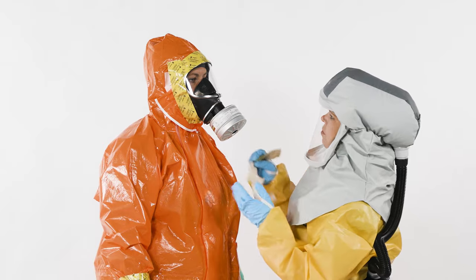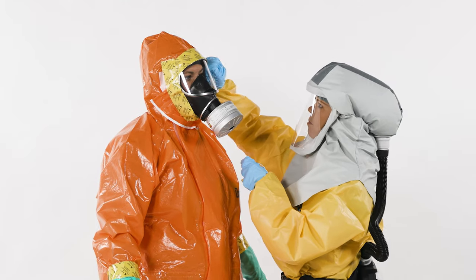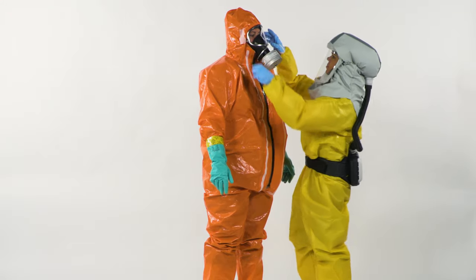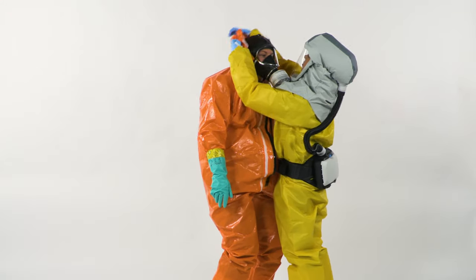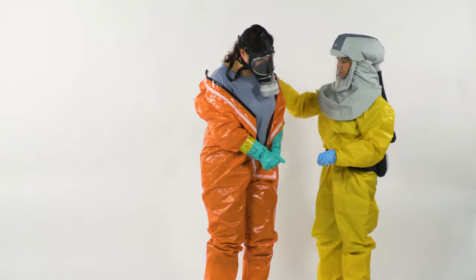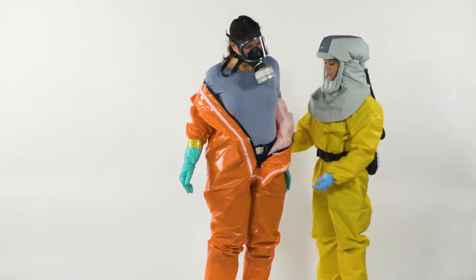Remove the tape between the mask and the suit. Open the zipper on the front. Slip the hood over your head. When doing so, your gloves must only touch the outside of the suit due to possible contamination.